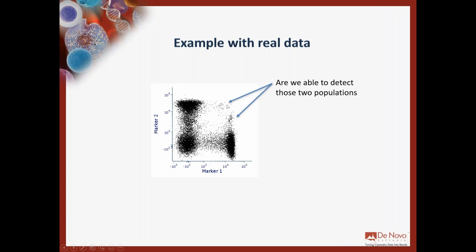So those are two markers, and my question was, I want to run tSNE. This is like 20,000 events. It's not really, but please take home the message. This might be 20,000 in this case, you might have 20 million, right? So can I run a tSNE and find two islands, at least two, for those two populations, let's say, a rare population, this one and this one.